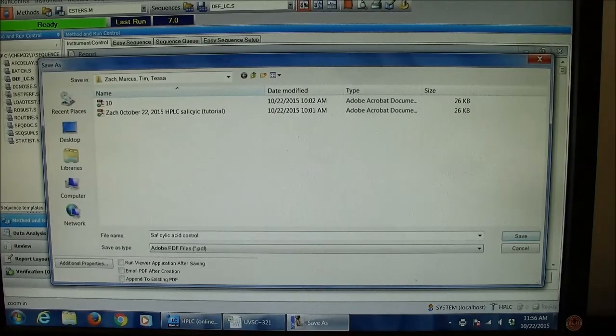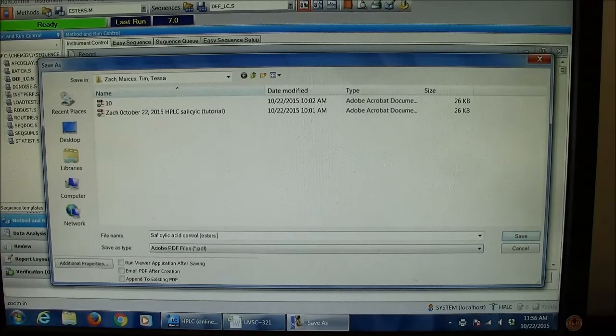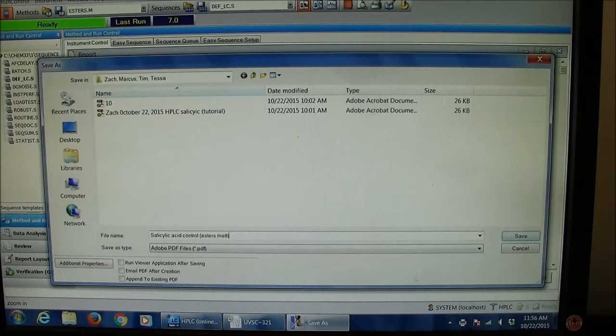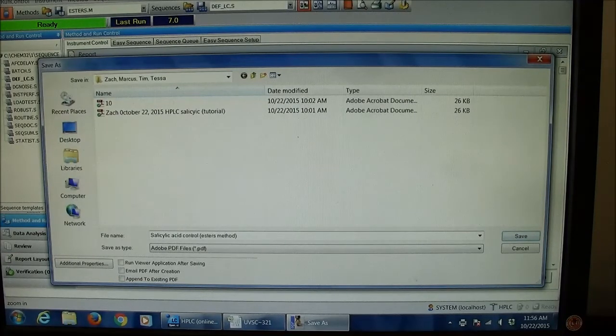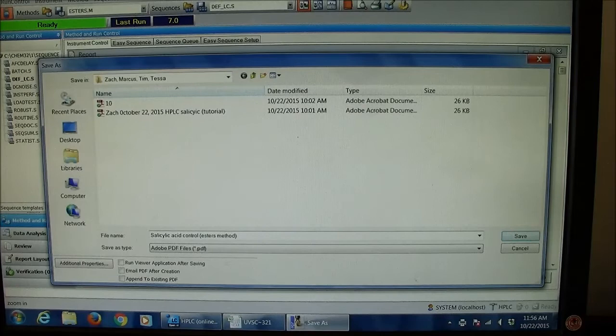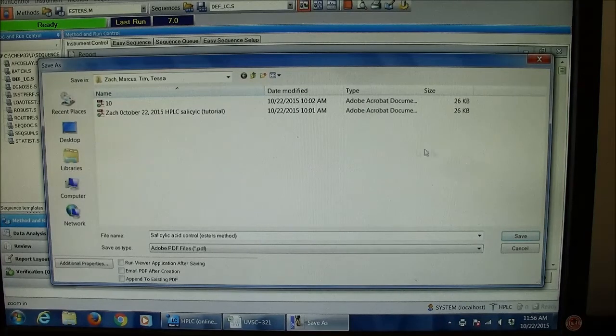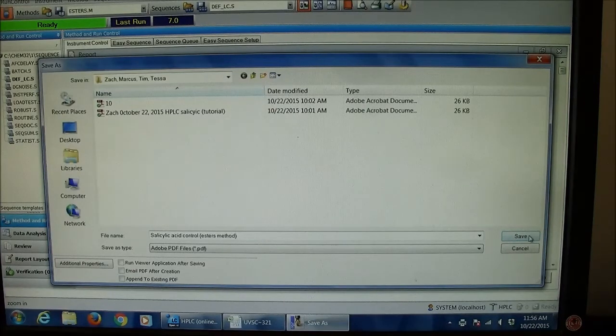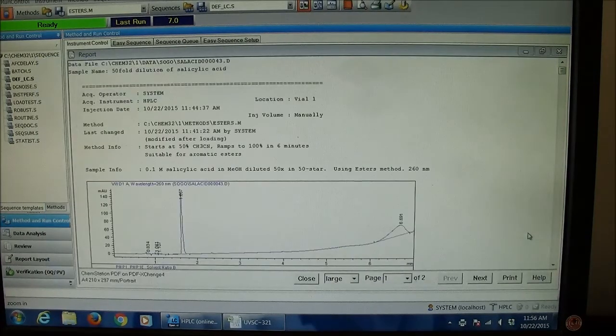Using the esters method. There we go. If I save that, then the PDF will be there, which anybody can access from anywhere.